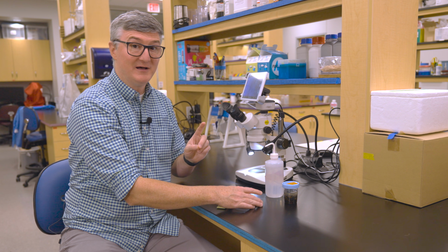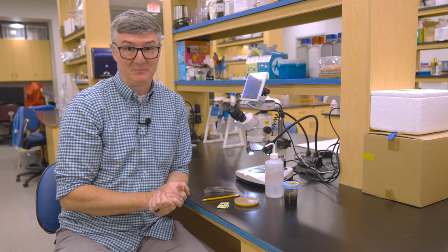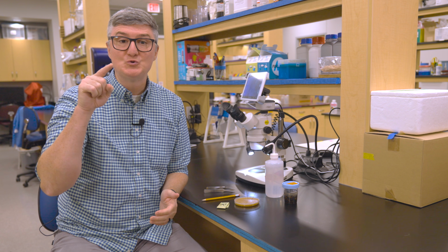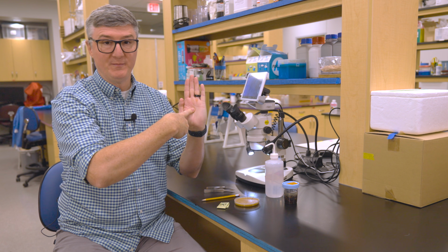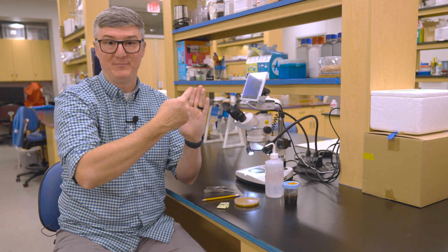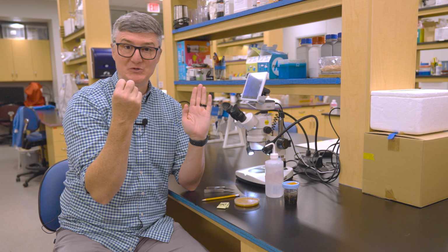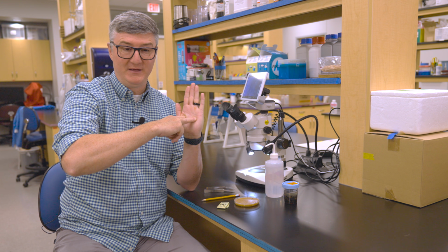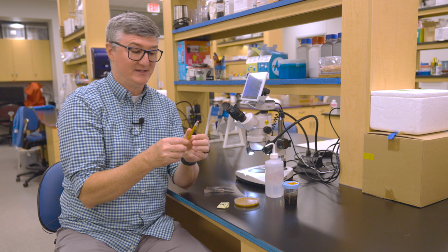A little bit of a cheat code with insect pins and securing bees into that beeswax. If you use 1 pin through the bee, while you work that bee, it's going to pivot around that pin. That's why I like to use 2 pins that go into the bee to keep that bee from pivoting. So the cheat is this.